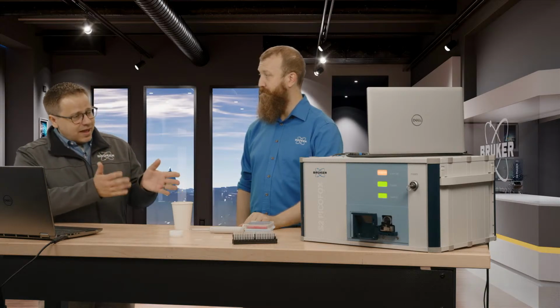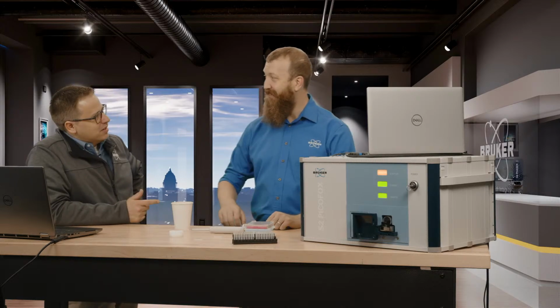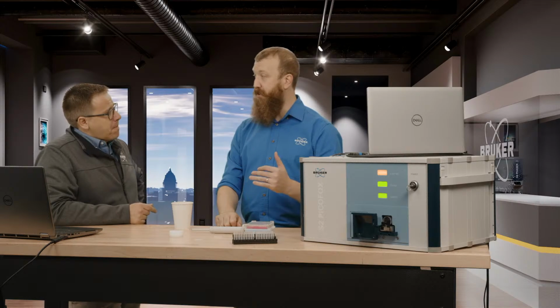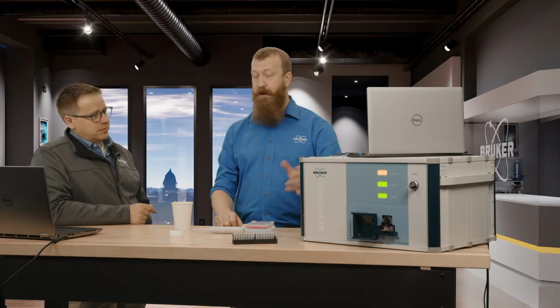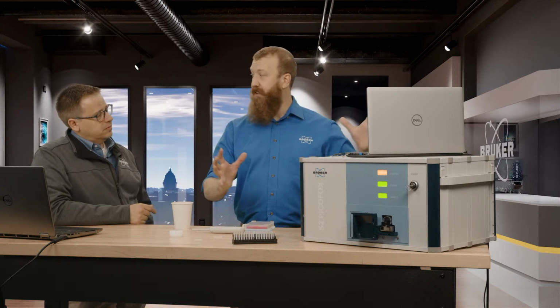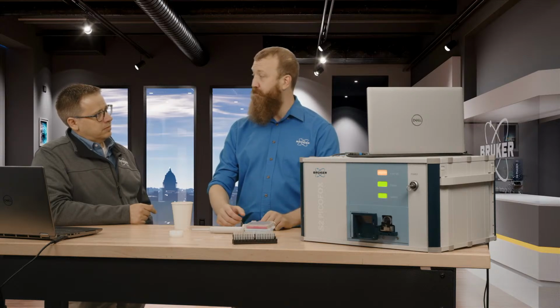But this thing is not the goulash pot. This thing is much smaller, and that's quite surprising. Yes, so TXRF is one of the techniques that was developed around the same time that XRF first came into existence. Okay. Yeah. Some of the earliest work was in, I think, like the 80s and 70s. However, as we got better and better detectors and better X-ray sources, we were able to take that technology, make it smaller, more convenient, and easier to fit inside of just about any lab.